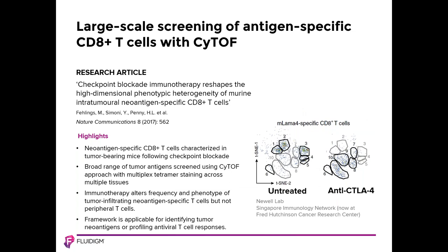This paper from Evan Newell's lab, where he was at the Singapore Immunology Network, highlights the use of mass cytometry to characterize neoantigen-specific CD8 T cells in tumor-bearing mice following checkpoint blockade with anti-CTLA-4 or anti-PD-1. A broad range of predicted candidate tumor antigens was comprehensively screened using a CyTOF approach with multiplex tetramer staining across multiple tissues. They showed that immunotherapy can alter the frequency and the phenotype of tumor-infiltrating neoantigen-specific T cells, but not that of the peripheral T cells. This framework is applicable for identifying tumor neoantigens or profiling antiviral T cell responses.